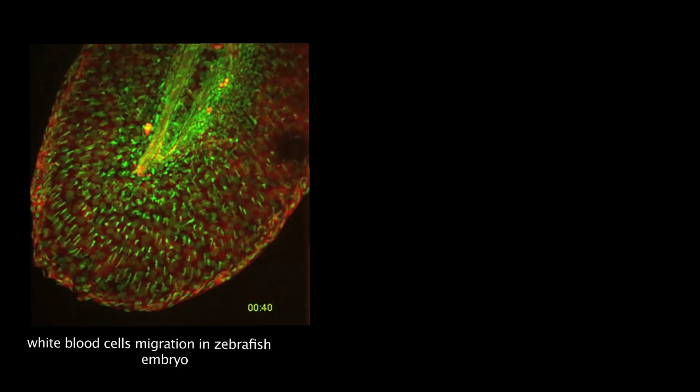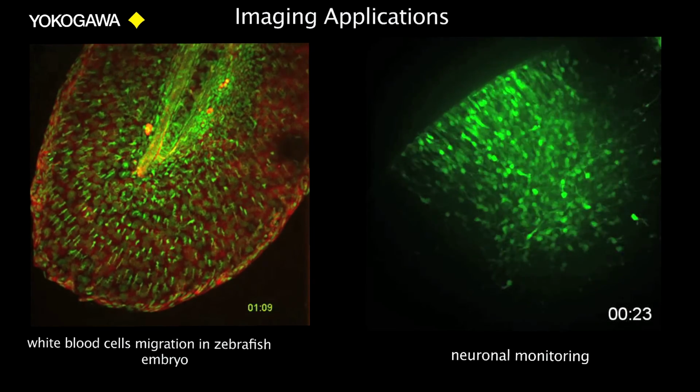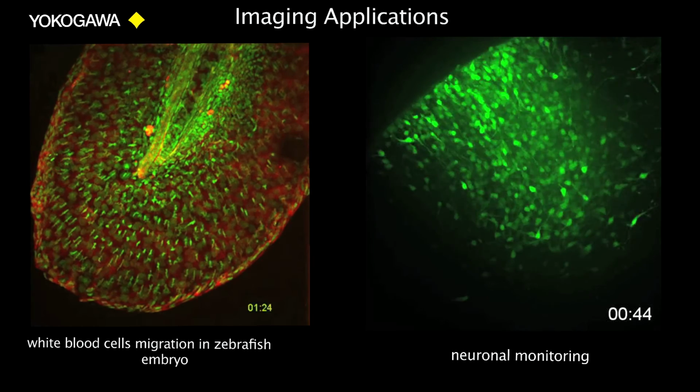This microscope is turning into a workhorse at the cell imaging core, presenting a solution for different biological applications. So at the moment we are starting to do imaging, for example, in zebrafish embryos or in a brain slice, that to do it live on the confocal would not have been possible.